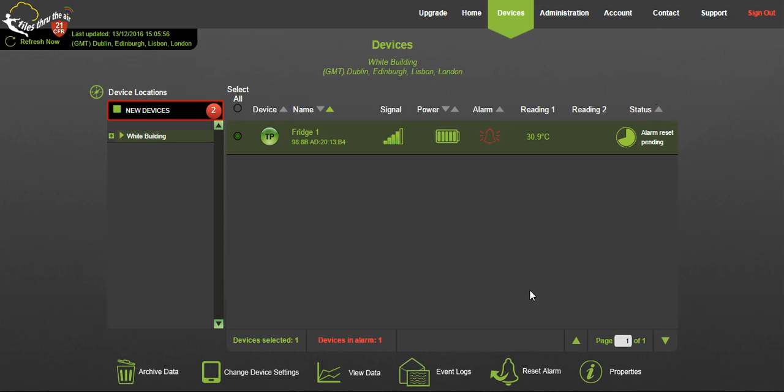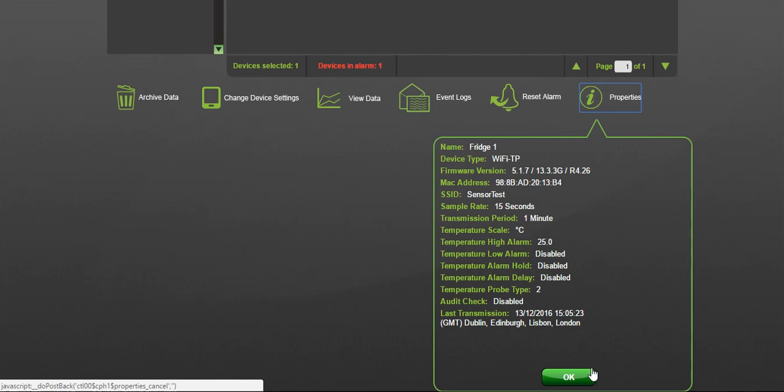Lastly, review the properties of individual sensors by clicking the properties icon. This will give an overview of details such as logger name, MAC address, current reading and its device settings.